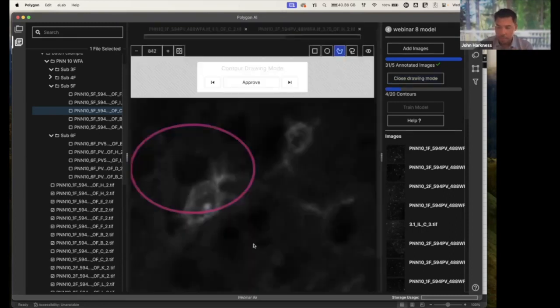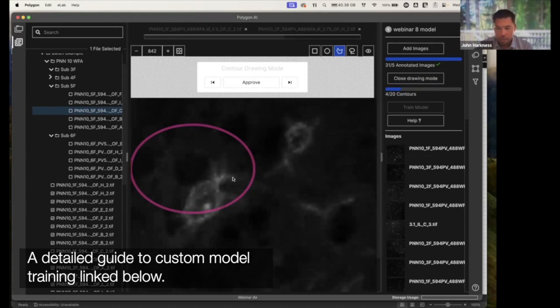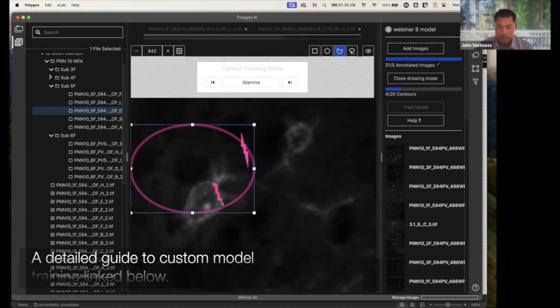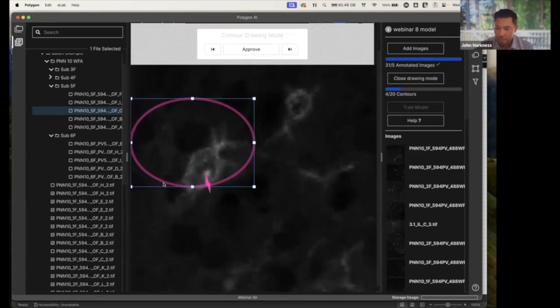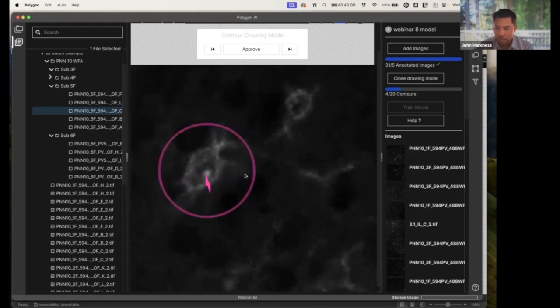And then lastly, I'm going to draw a couple contours within these bounding boxes. So this does 2 things. One, it allows me to see maybe where I was a little sloppy with my ROIs. So I've selected my ROI. I'm going to move my ROI down so that it better encompasses that whole cell. In this case, maybe I'm going to bring in that side of it. It's drawing a little as I do. And then I'm going to draw a contour around that cell.